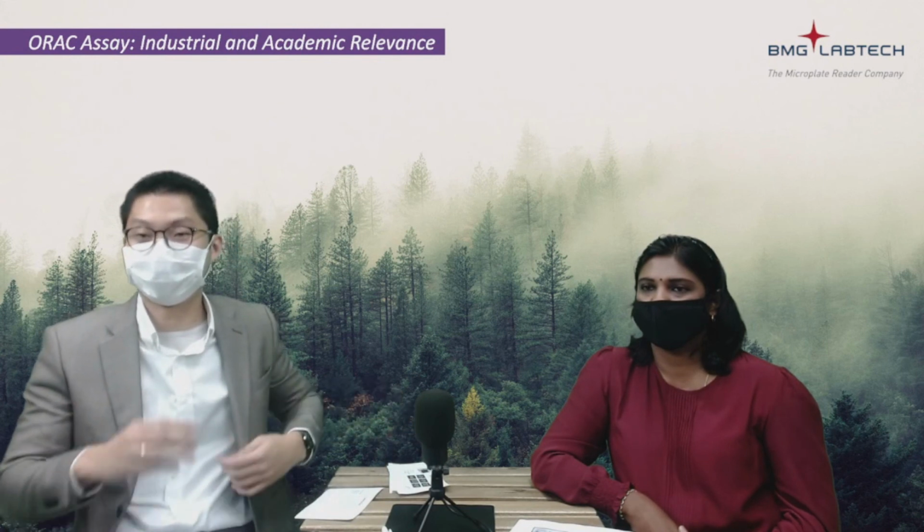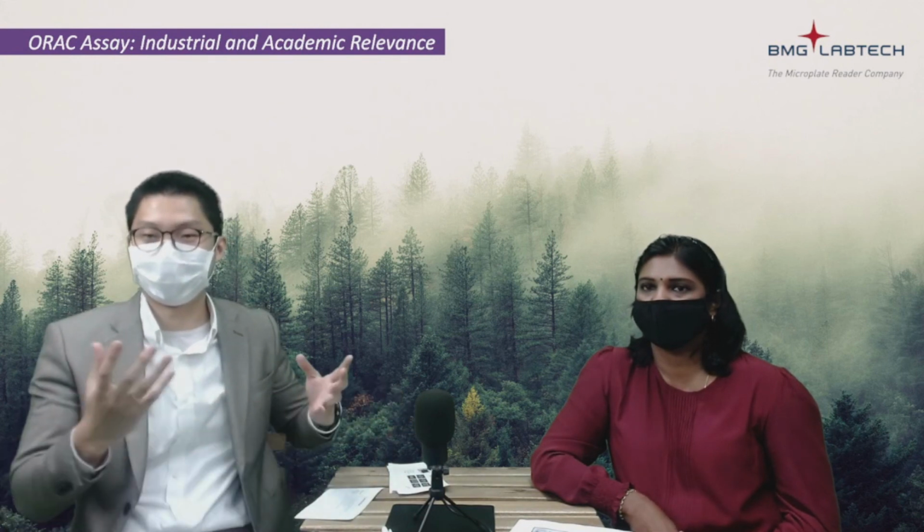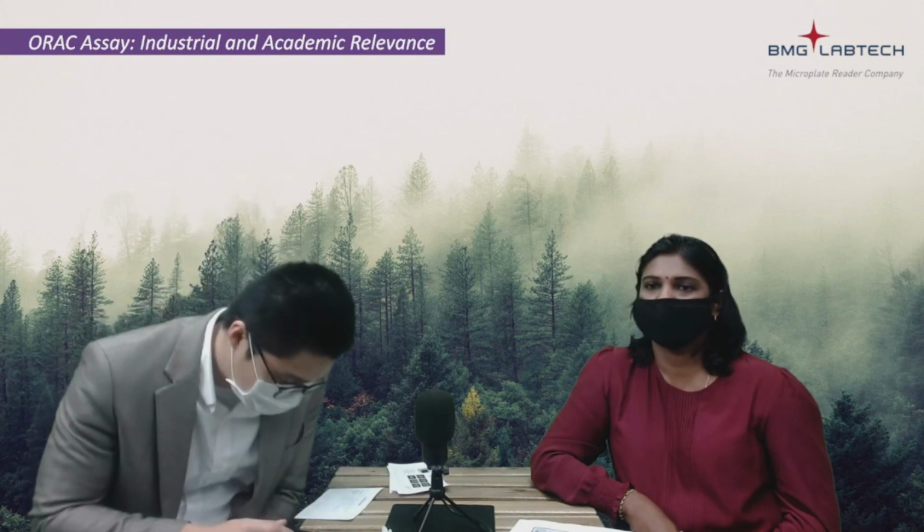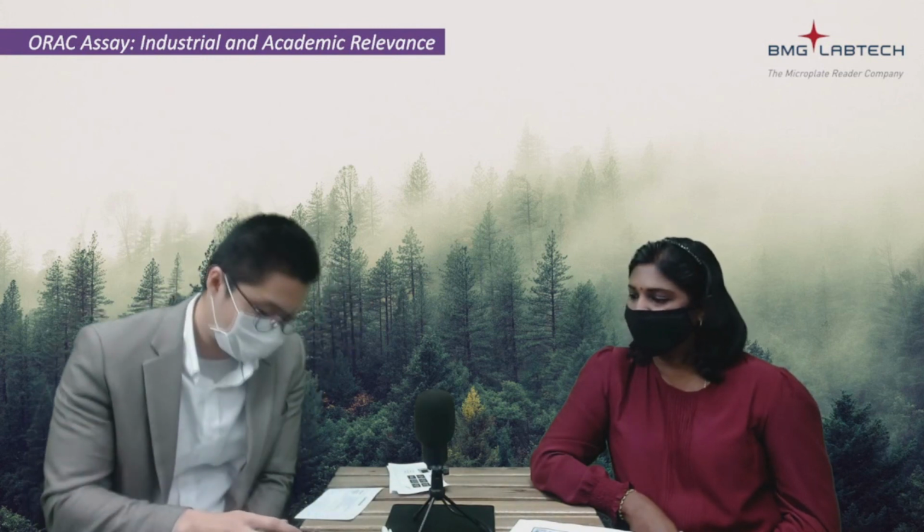Alright, I hope that video is useful and interesting for you. So as you can see, if you're growing cells, we can actually put in an atmospheric control unit. So if you're growing any anaerobic bacteria or anaerobic cells, then we can actually control the gases inside, and you can just put the cells on a plate, leave them on, and then just go away and get your results later. So we have a few more questions here, so I'll just go to the questions first.